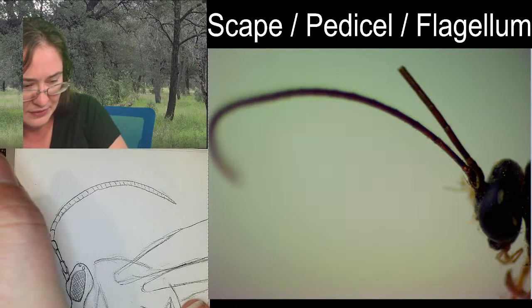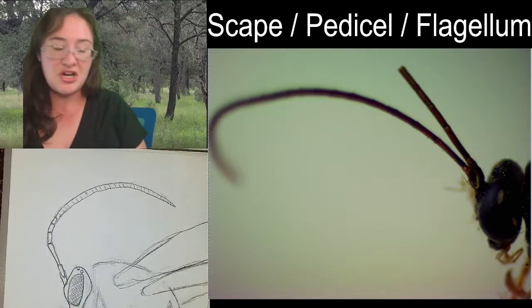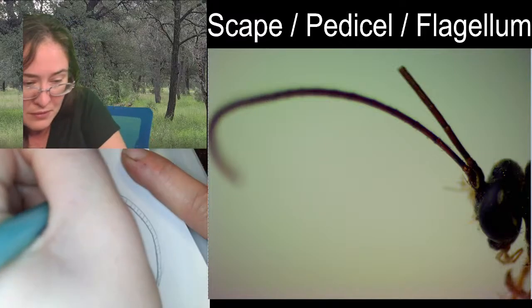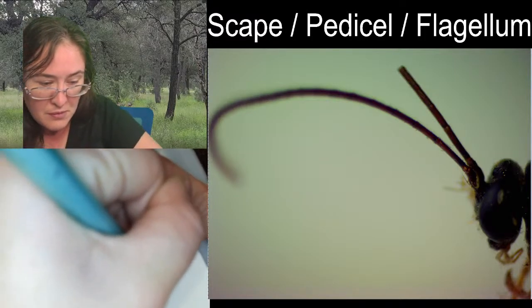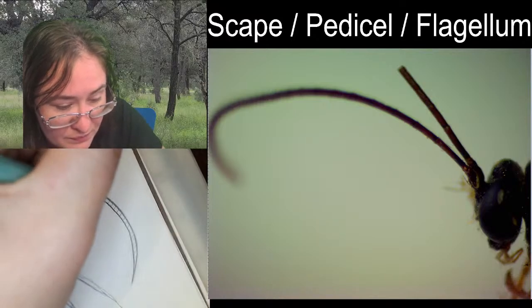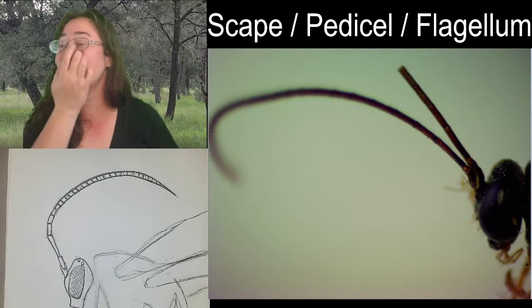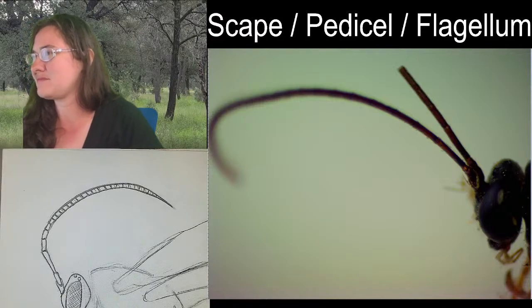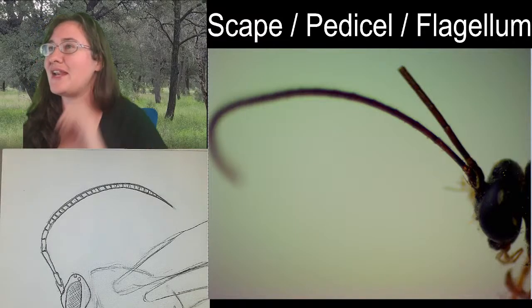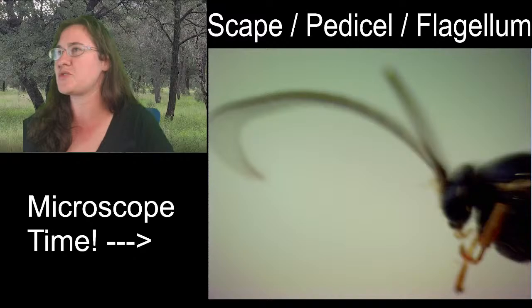Let's see. I wanted to come back in and darken this for you guys. Yes, the segments are straight with a little flange at the end. And yes, one of my antennae broke off, but this one that's close, we can see all the entirety of.